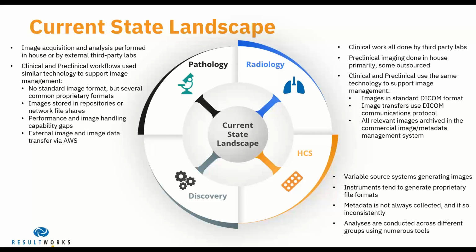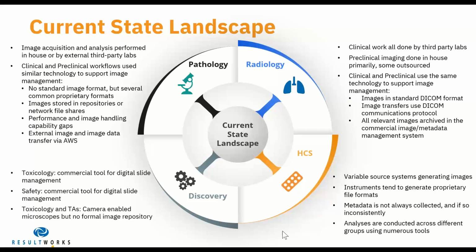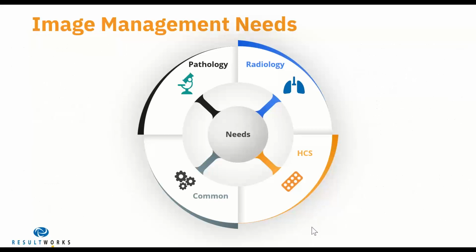So quite a number of issues there in the high content screening area to be addressed. And then in other areas of discovery, toxicology was using a commercial tool for digital slide management, as was the safety group. And then the toxicology and the therapeutic areas were using camera-enabled microscopes but really no formal image repository, which again was problematic. So that was the landscape.